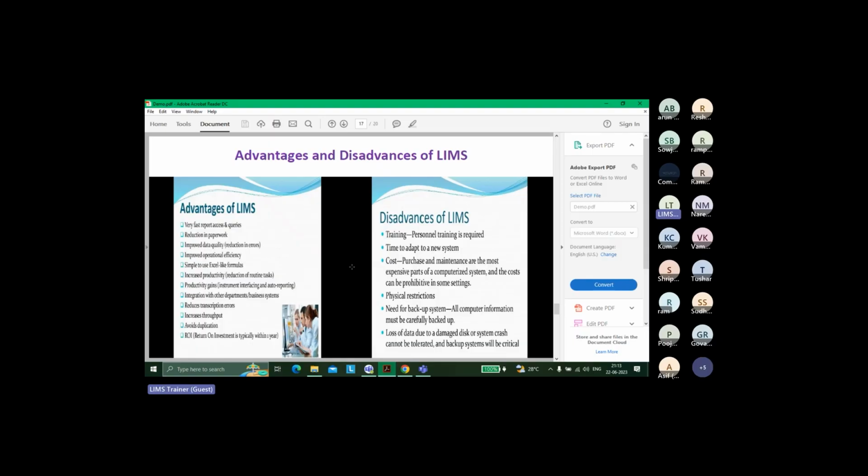This is what is actually making life simple, and that instrument is already integrated. And if you are able to automate certain instruments, writing some scripts by parsing and connecting it with LIMS, it's directly taking the values and your value is getting populated directly. Life is getting simpler.